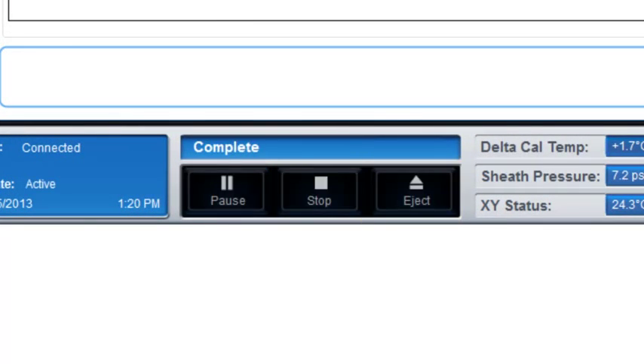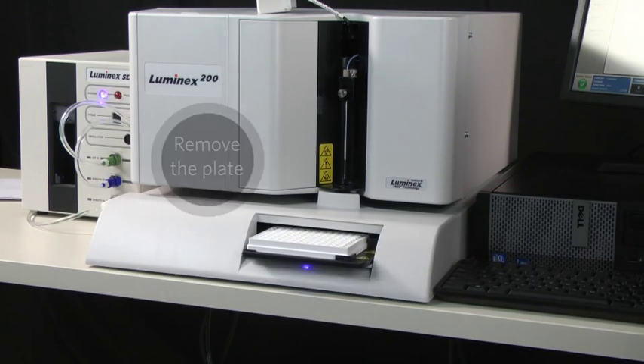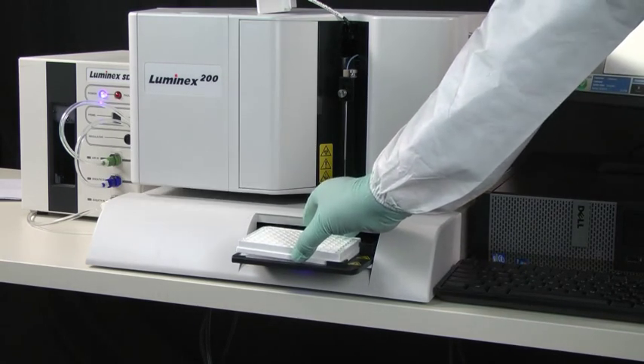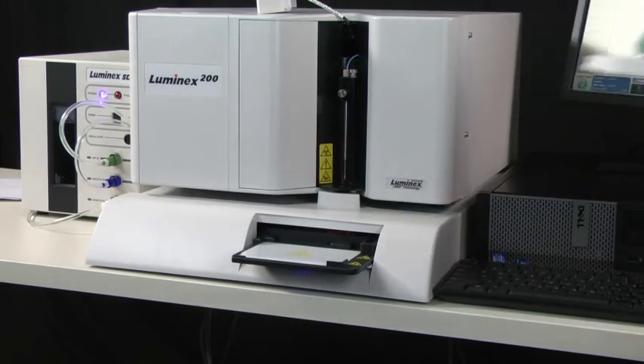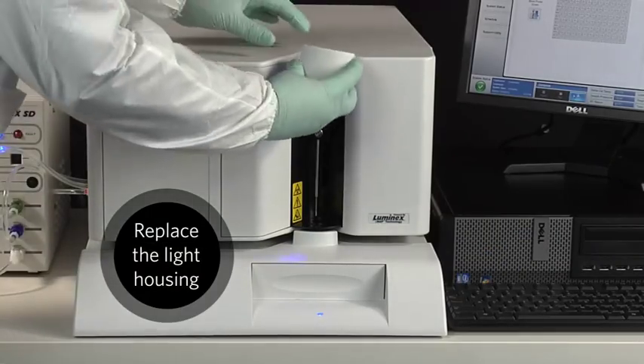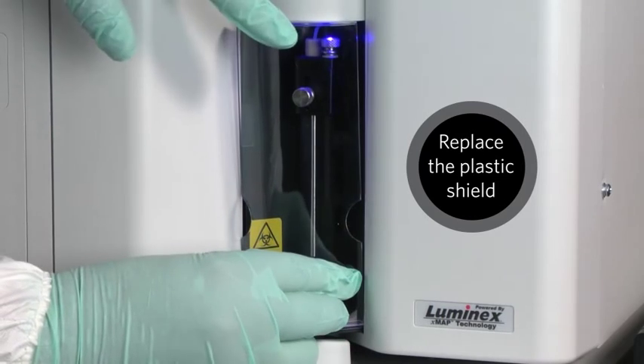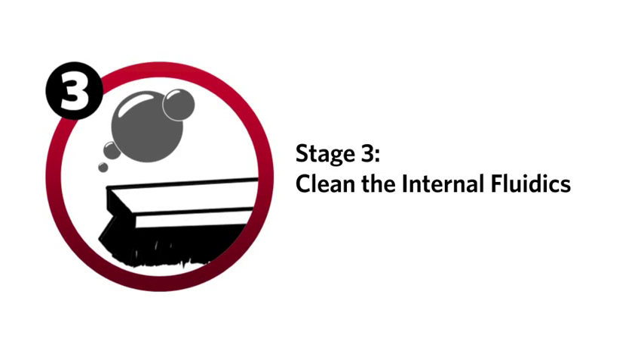Eject the plate holder. Remove the microtiter plate and retrieve the height adjustment tools and set them aside for future use. Replace the light housing. Replace the plastic shield. Now that we know the sample probe is clean and at the correct height, we can move on to the third step: sanitizing and washing all the lines inside the instrument.